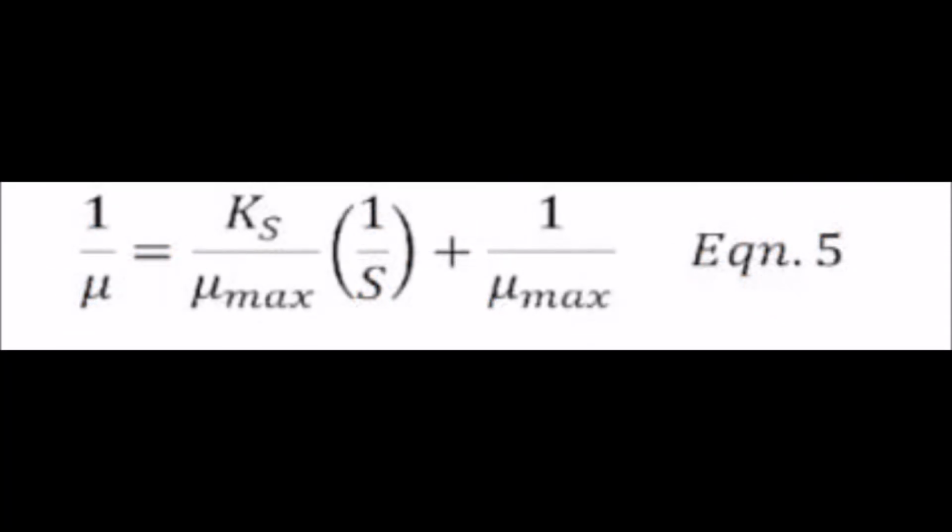The third equation can be rearranged so that mu can be solved for using the Monod constant and the substrate concentration, as well as mu max.